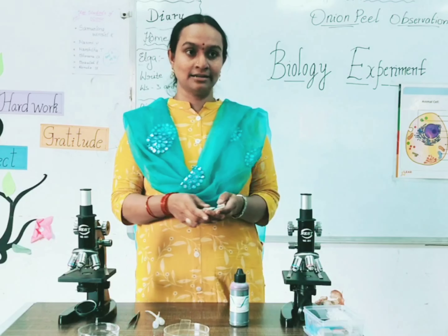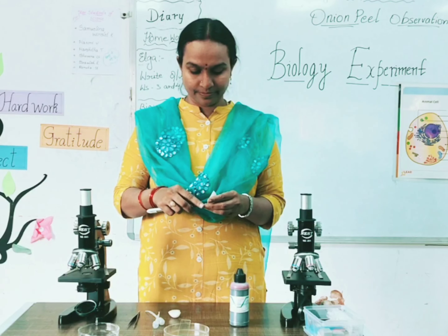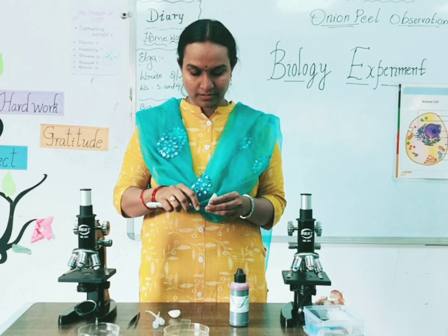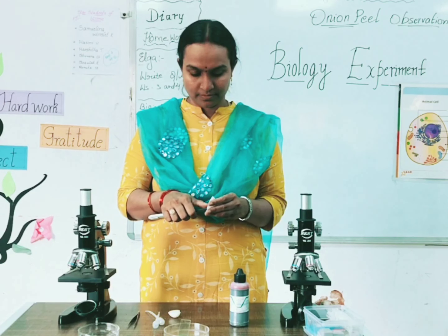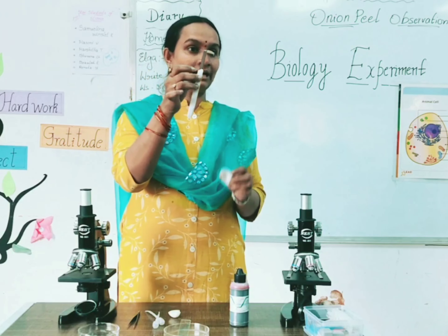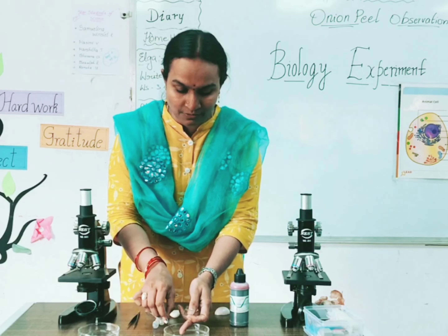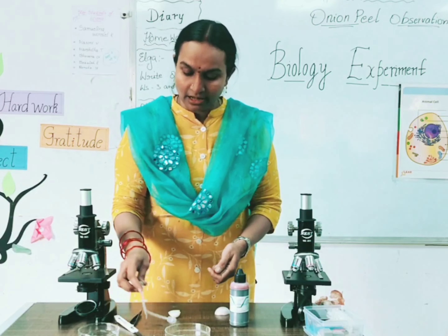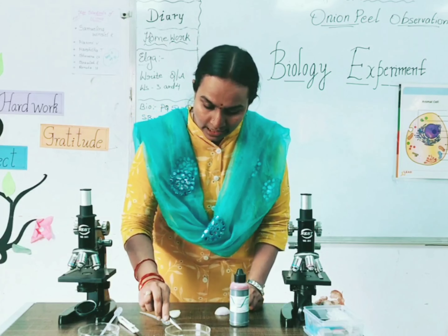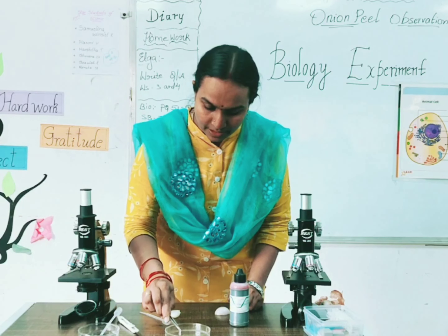Let us start. First I am taking the peel outside — a very small peel I am taking out. It's very easy to take out. With the help of a cutter we can easily peel a single layer of an onion. Now I am going to wash it with some water. Here I am taking a dropper, some amount of water, and just going to wash it first.